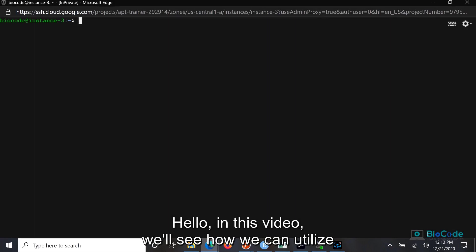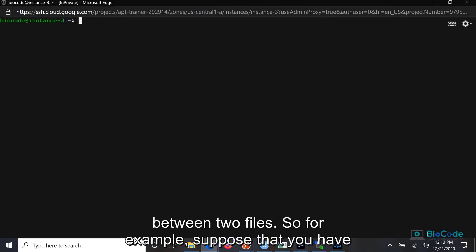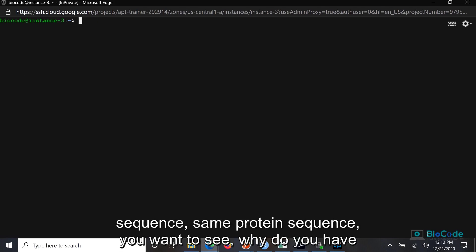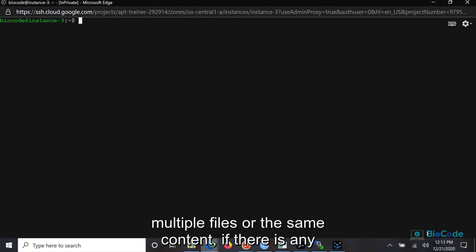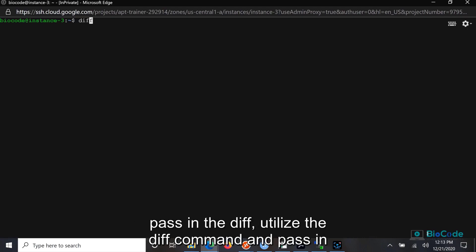Hello and welcome to Biocode. In this video we will see how we can utilize the diff command on Linux to see the difference between two files. For example, suppose you have two files corresponding to the same gene sequence or protein sequence and you want to see if there is any difference between those files. All you really have to do is use the diff command.